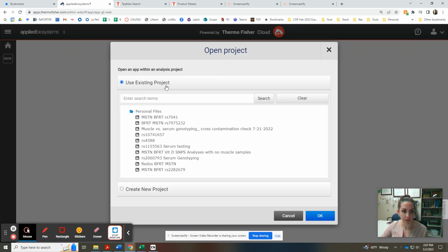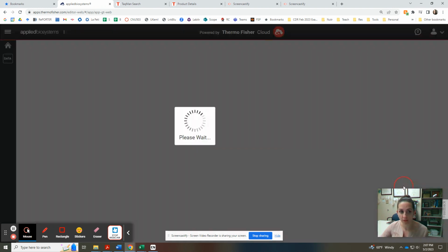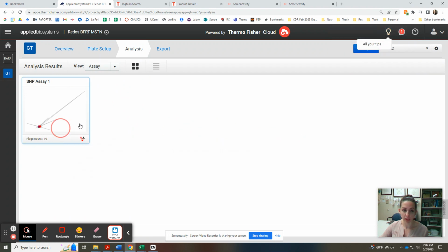I have already created a project. If you hadn't already created a project, you would create a new project and then just follow all the prompts to upload your EDS files and get started. I'm just going to click into a project I already have open and created. So it's going to bring that up.